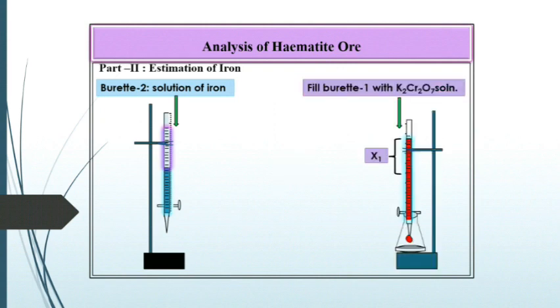Now titrate this solution with burette number 1 containing K2Cr2O7 solution drop by drop till the solution in the flask shows intense blue-violet coloration. Record this reading as X1 ml. This is the end point of the titration.